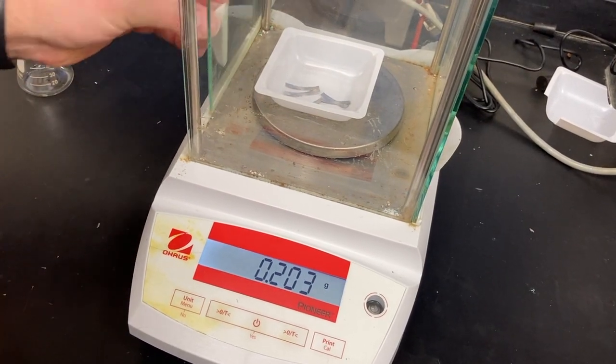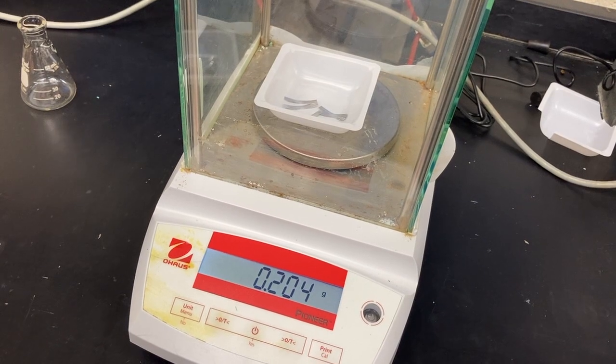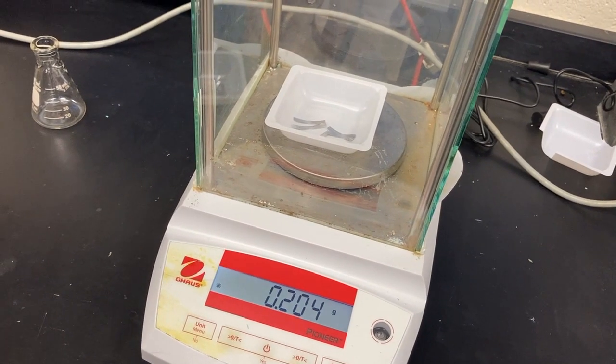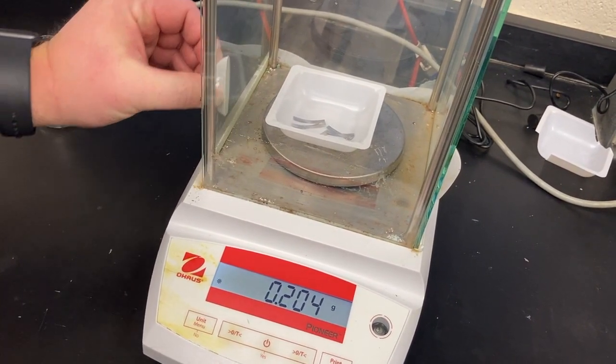Here we go. But Mr. Tro, that's not exactly 0.200. It's okay, the lab says about 0.2. What's important is we know the exact mass, not that it's exactly 0.200. So 0.204 grams is the mass of our magnesium.